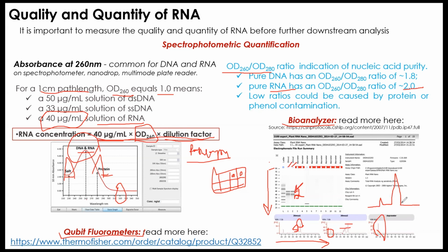And it also gives you values in terms of the RNA integrity number. If it crosses 7, for example, here 7.3, 7.8, it should be sufficient to conduct the RNA sequencing or different downstream processes, right?